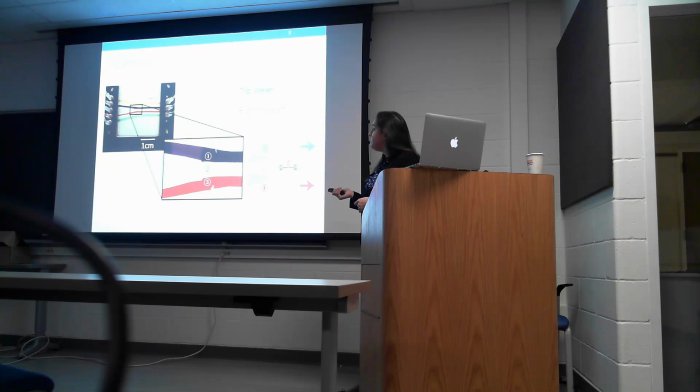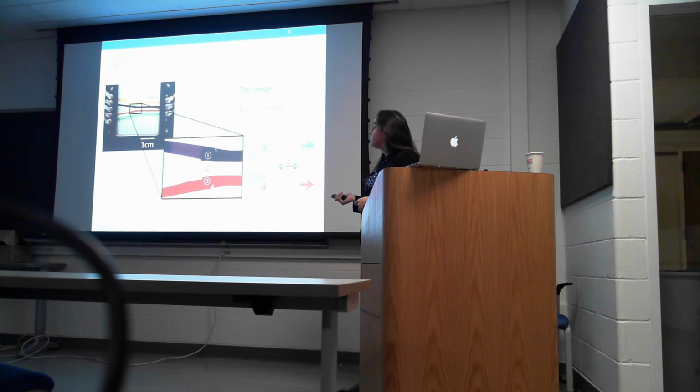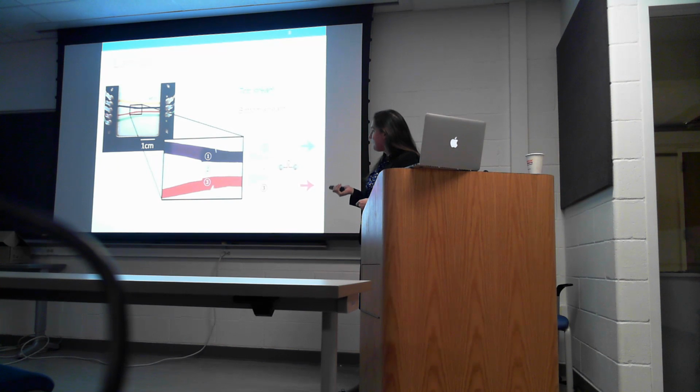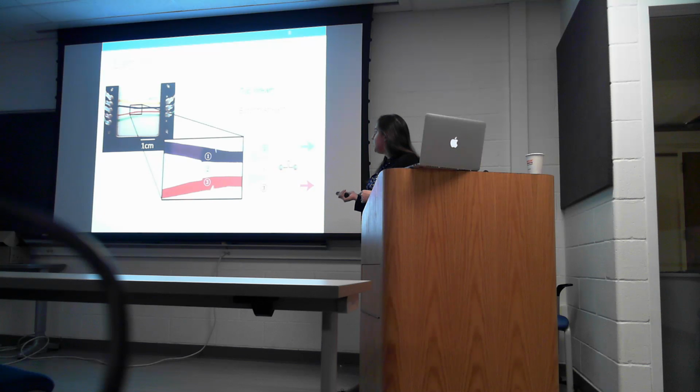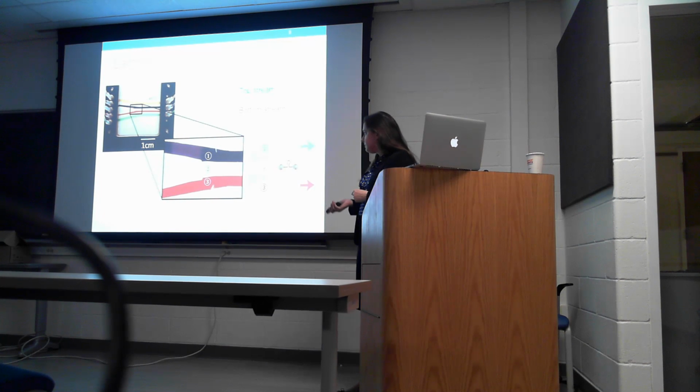So this is blue food dye in the top stream, red food dye in the middle stream, and nothing, or red on the bottom and nothing in the middle. You can see a really clear distinction between each stream, which allows us to have different buffer conditions and move from stream to stream with our DNA construct.